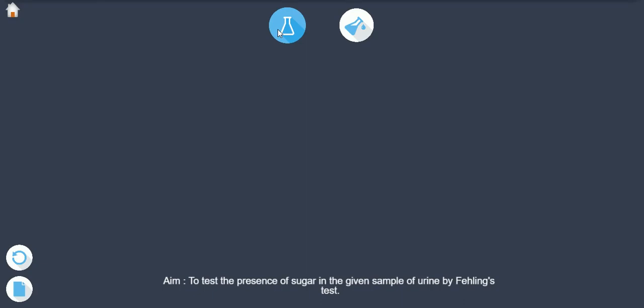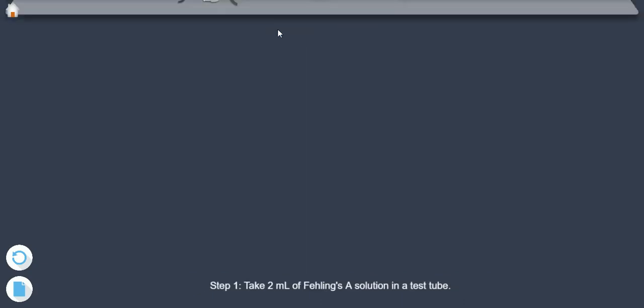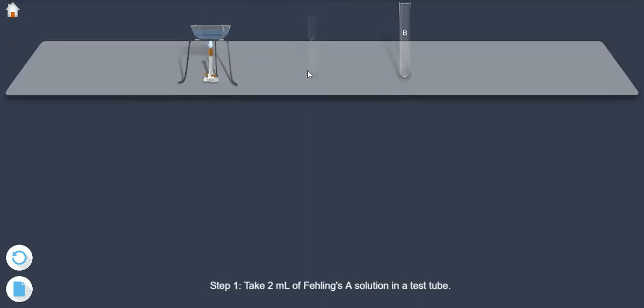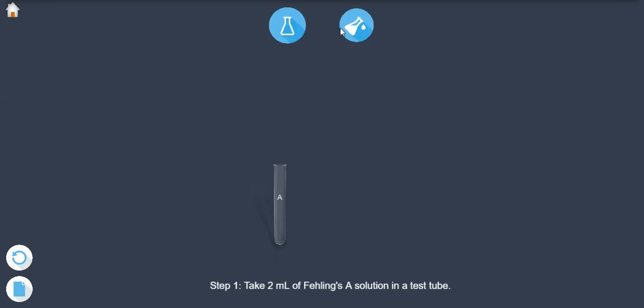Step 1: Take 2 ml of Fehling's A solution in a test tube.